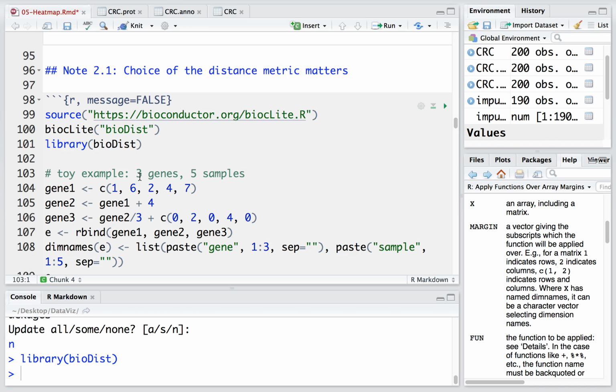For the last two hands-on sessions, we still include heatmap. We have another hands-on on multi-dimensional scaling because we will need to do some statistical analysis. So we'll start to use some packages from Bioconductor. And every time you see an error, no such package, just try to install it first.